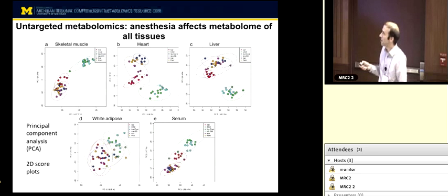The separation may be a little bit cleaner in this case from one condition to another. We can pull out things that may separate one mode of anesthesia from another, but the overall pattern is fairly similar to what we saw in the principal component analysis. So we've got something going on here for real. And looking at it again a little more closely, this I already defined. The largest distinction is between methods involving anesthesia and euthanasia.